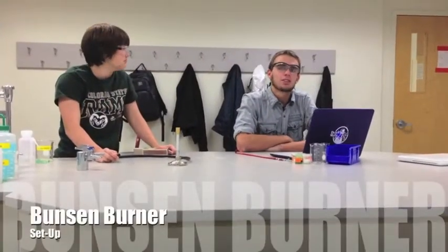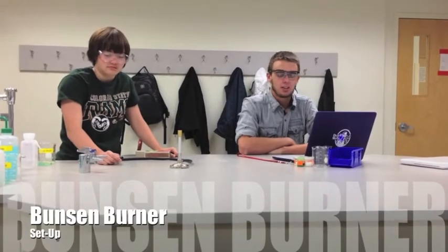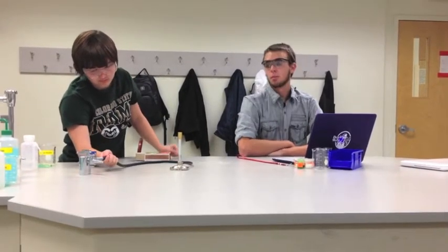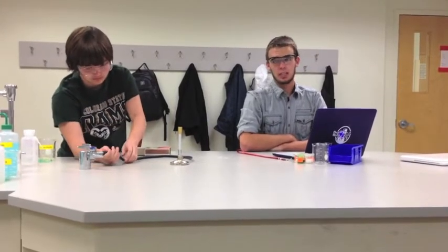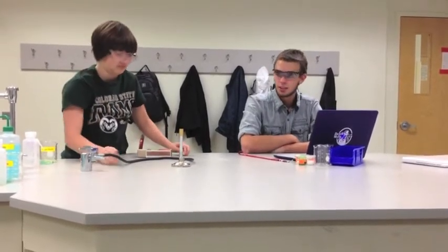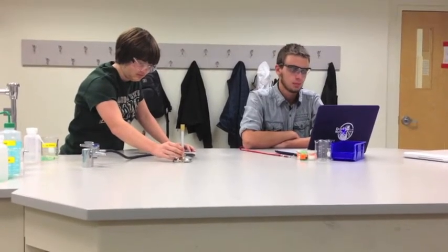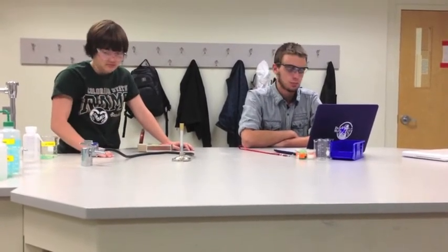Now we're going to show you how to set up your bunsen burner. First thing you need to do is attach your hose or your bunsen burner to your gas source. Make sure it's on tight enough that it won't leak. Next thing you need to do is open the collar of the bunsen burner and turn on the gas source partway.